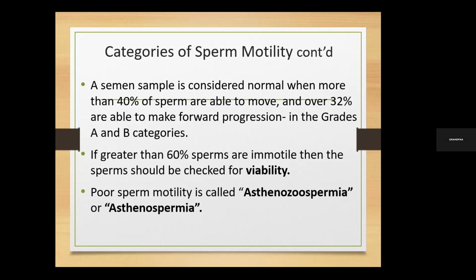When you are making an estimate, it is almost impossible to get a value of 32. At best, you can get values in steps of 5. So you can say 5%, 15%, 20, 25, 30, 35. That one you can estimate. But to say 32 becomes almost practically impossible. All right, so take note of those things.